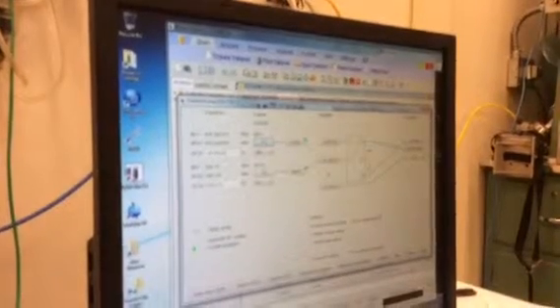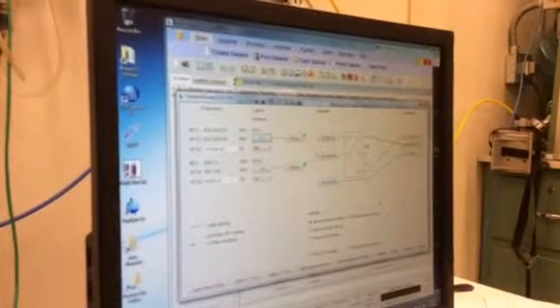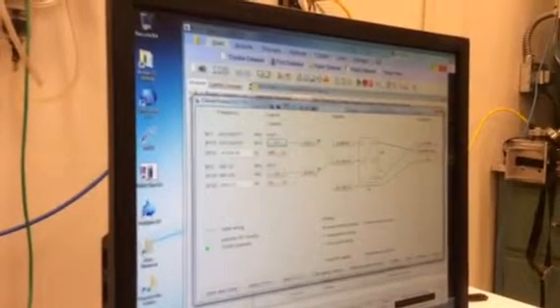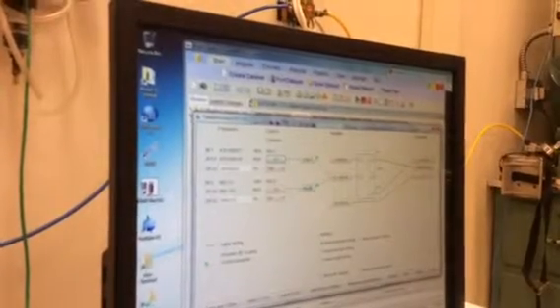Proton, possible RF. Actually, you guys, I'm not so sure about this one. The reason why it looks odd to me is because why isn't it going through the proton channel here for the decoupling? I'm not sure why that is.